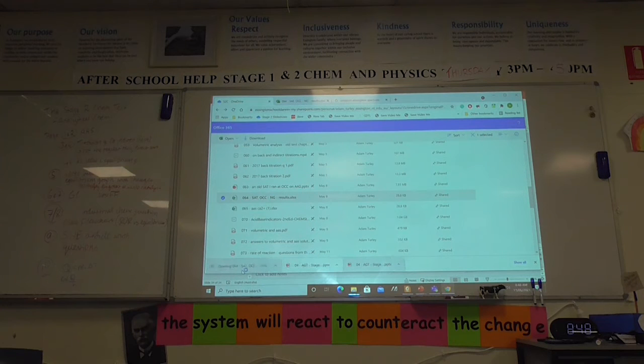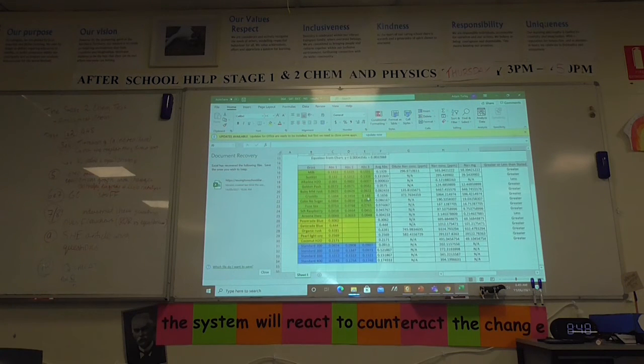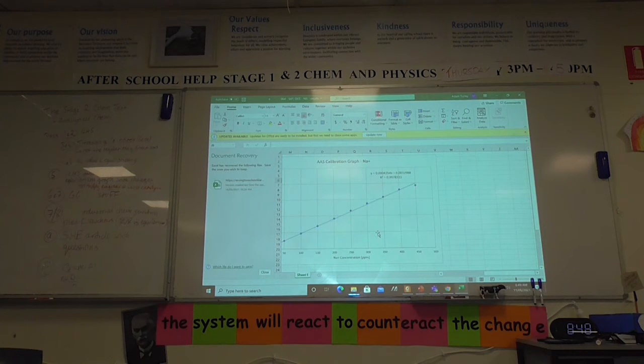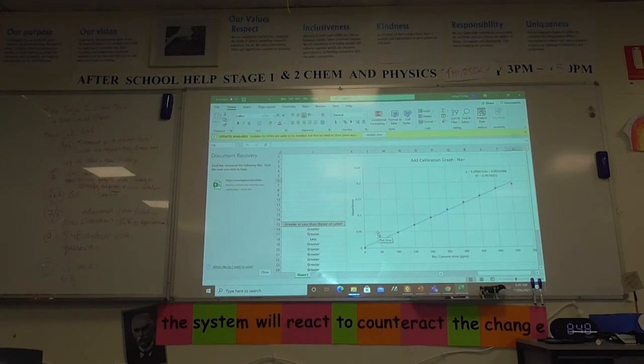These guys, what they got was a set of results where I ran soft drinks through the atomic absorption spectrometer here at CDU, and I looked for sodium. So that was the concentration curve there. And that was based on samples which are made. Might just look at the curve, please.